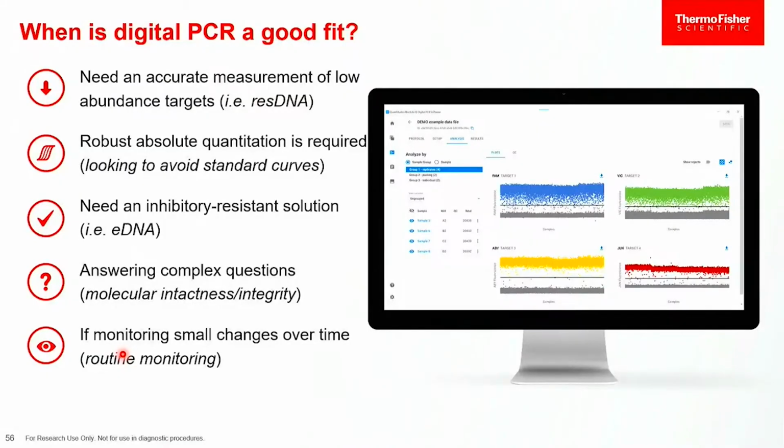That 1.5 to two-fold change is the limit because of our uncertainty in measuring CT values and measuring the data. If you have changes that appear to be consistent below that value, move to digital, because its error bars are so much smaller, you can assess those changes and get down to about 10% difference, 1.1-fold.